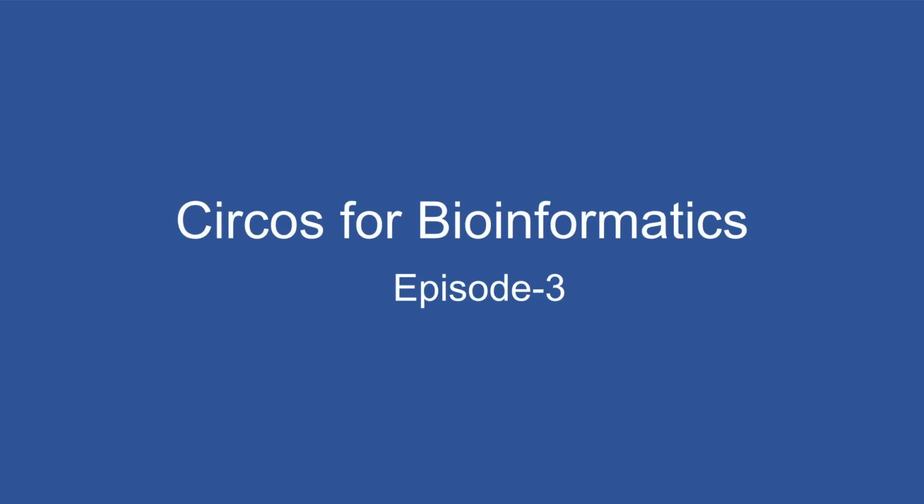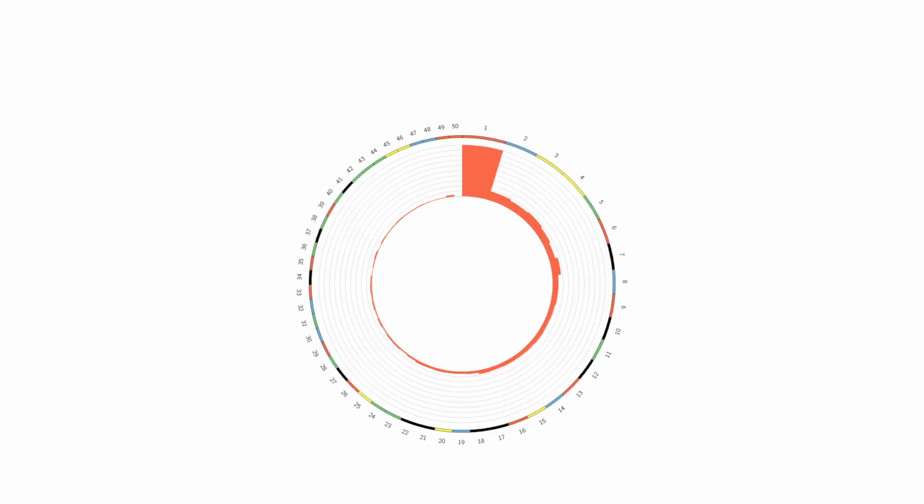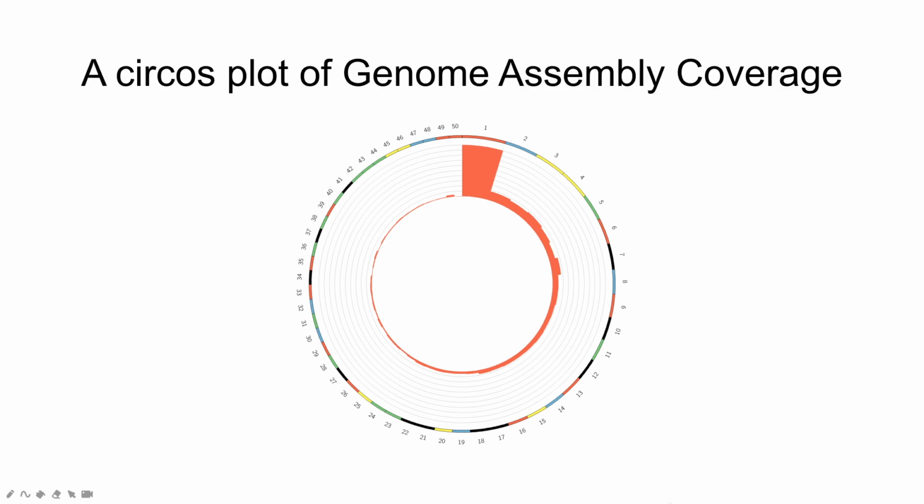Hi everyone, welcome to another episode of my tutorials on Circos for bioinformatics. In today's video, I'm going to show you how to generate this cool Circos plot here. This is a plot showing the genome assembly coverage of a bacterial isolate.